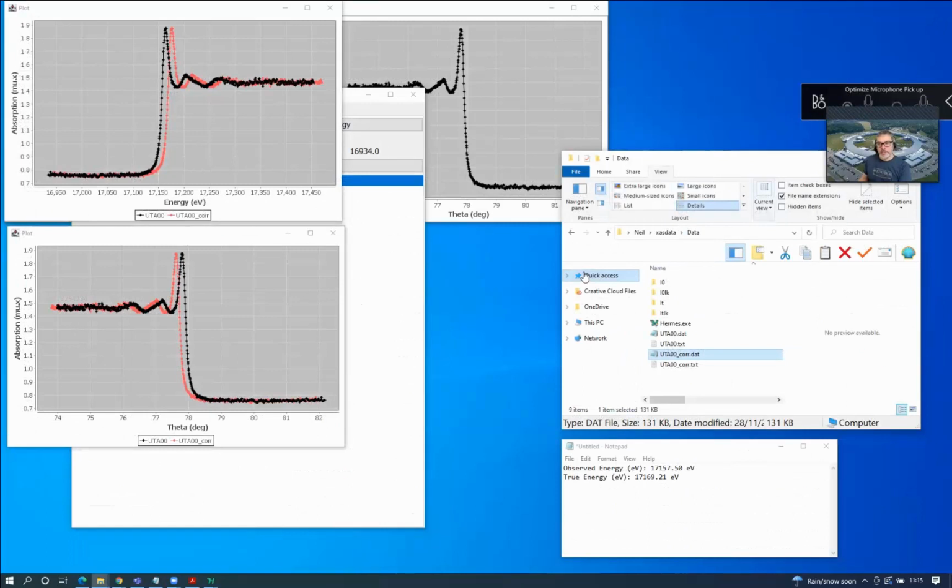So that about concludes this tutorial. I hope you find the functionality of HERMES useful for your research. We've certainly found that it's reduced our error rate in data pre-processing, and I hope you have many happy hours of using it. So if you have comments or suggestions on the software, please send them in via the GitHub site, and that's all for now.